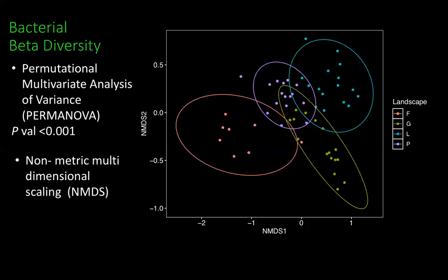So these are individual samples. And as you can see, what we expected, that these different microbial assemblages are going to be different throughout these landscapes, you see this sort of tight clustering. So you see the gardens clustering in this section here. On the other end, you see these lawn communities, followed by these parks and these gardens. They're all clustering individually.